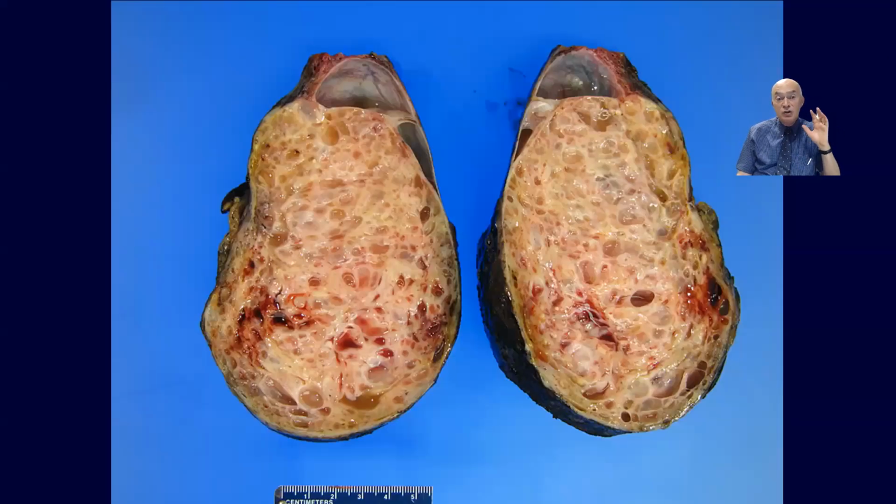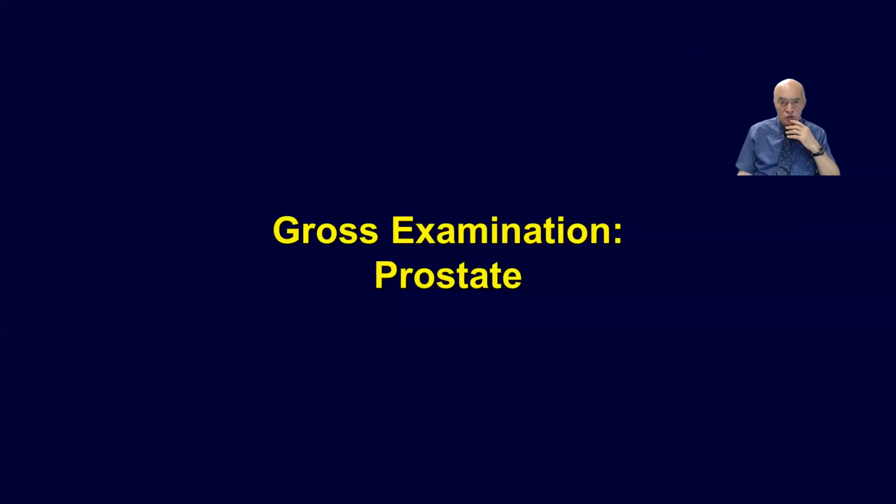This typical tumor with all these cysts here, with that large kind of fibrotic appearance, is typical of the teratomas. So teratomas are going to have this cystic appearance in the gross examination, but still, you don't know if there are some mixed germ cell tumor components in other areas, so we need to be careful to sample religiously in all the areas of this tumor.